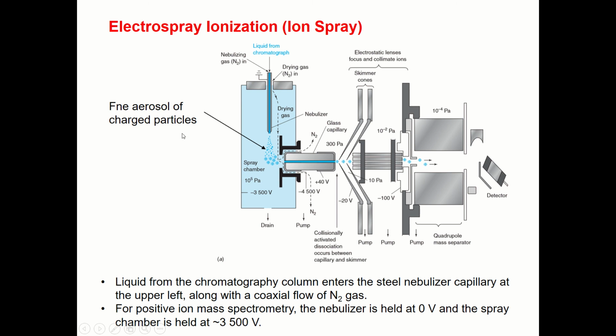Importantly, it is charged, because the chamber itself has a negative potential applied and the nebulizer is grounded. Under this high potential difference, your samples are charged and become a fine aerosol, and then it enters this part.